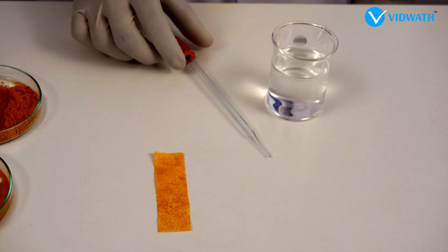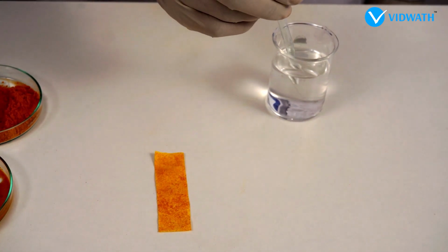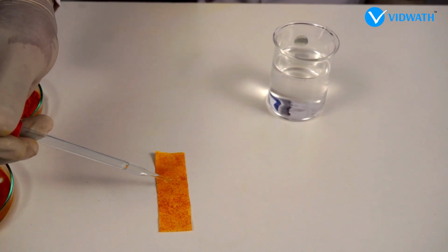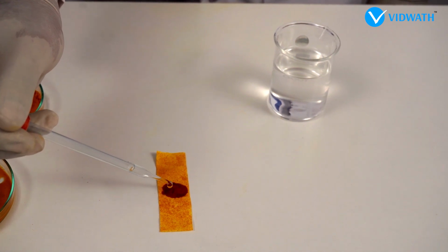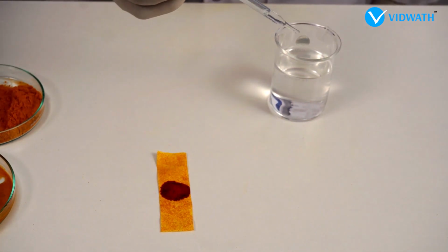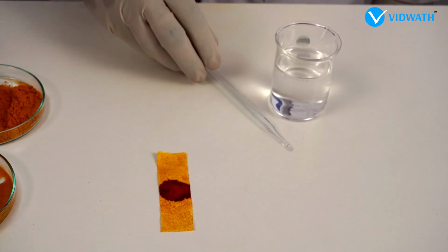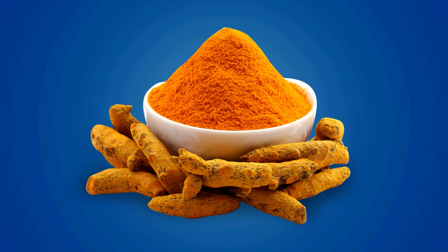Put a drop of soap solution on the strip of turmeric paper. What do you observe? Observation: we observe that the turmeric changes color when soap solution is added to it. Inference: the substances that indicate a change in color when some substances are added to them are known as indicators. So turmeric is a natural indicator.